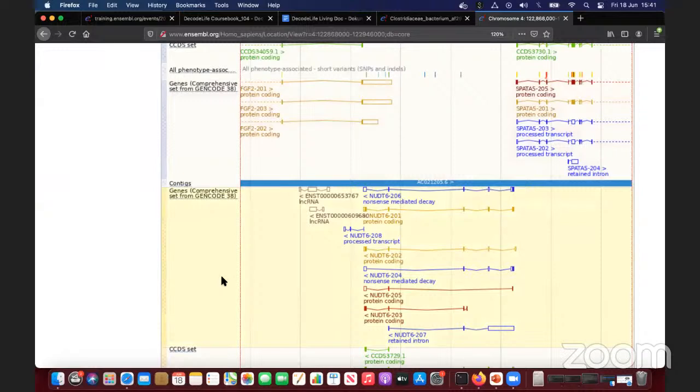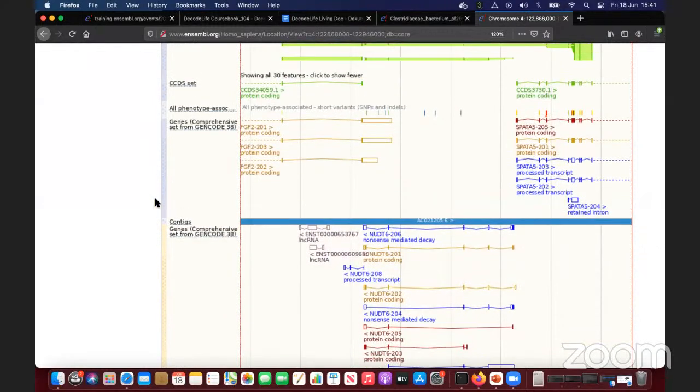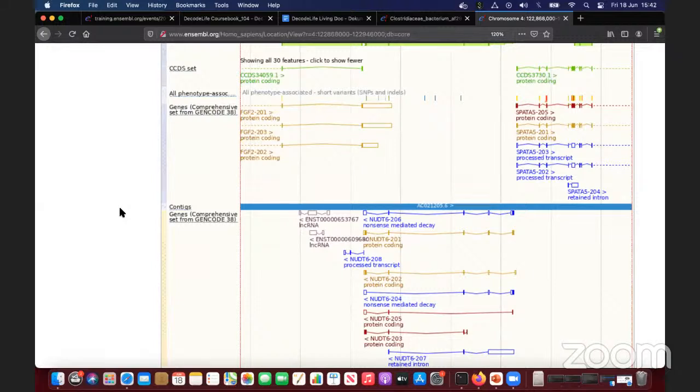You can also see that those tracks are shaded differently. So reverse-stranded tracks have this peach highlight over here, while the forward-stranded tracks have this dark blue highlight. And then tracks which are not strand-specific are shown in this light blue color. So for example, genetic variants affect both DNA strands, so they're not strand specific, and therefore they're unstranded, so they're shown in this light blue color.